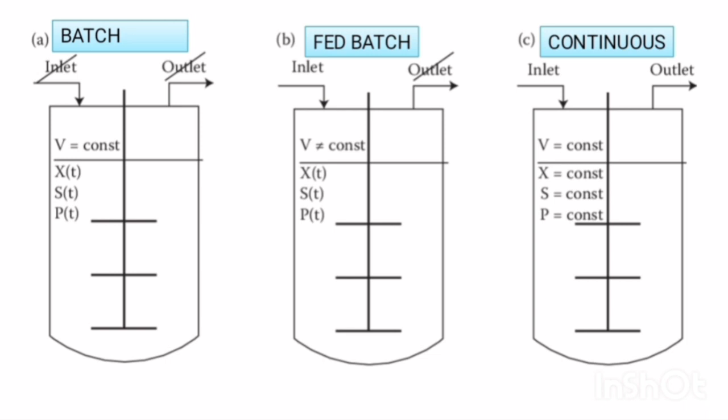Fermentation can be carried out as batch, fed batch, or continuous. In this video, we will discuss this type of fermentation or fermenters.